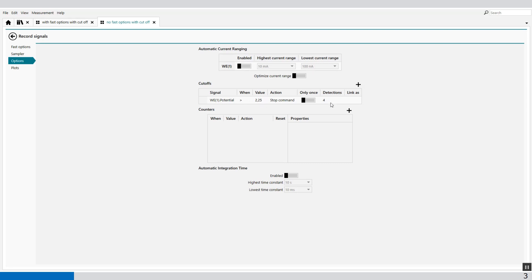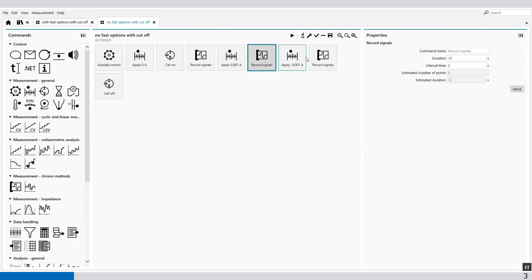the potential will be cut off when the potential becomes bigger than 2.25 volts, and we need four detections above this value to cut off the command.